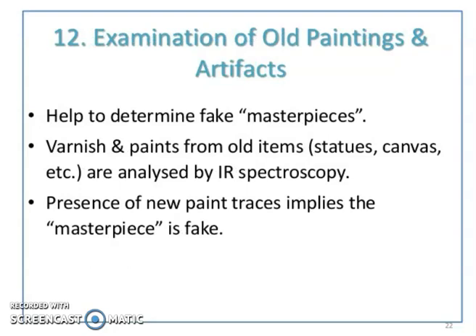Examination of old paintings and artifacts. Helps to determine fake masterpieces. Varnish and paint from old items, statues, canvas are analyzed by IR spectroscopy. Presence of new paint traces implies it is not a masterpiece.